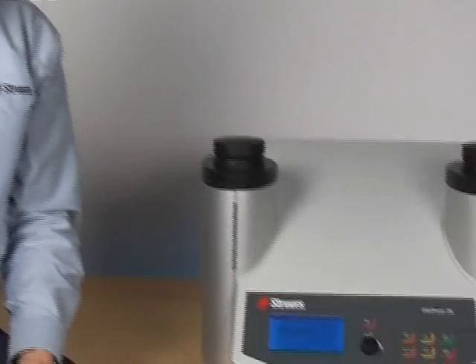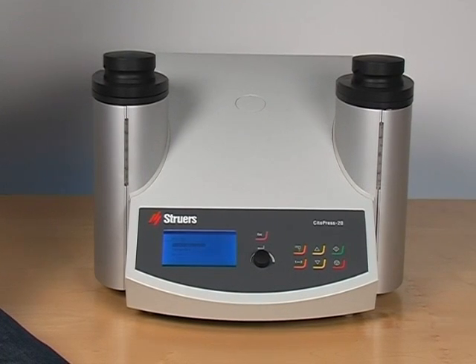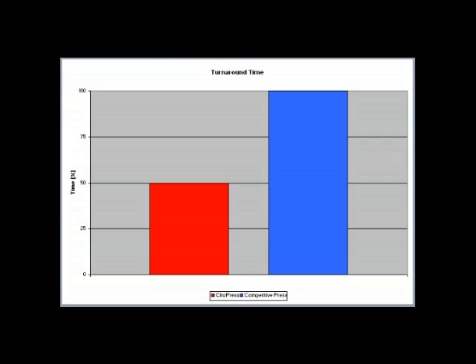We have taken a fresh look at what really matters for users of mounting presses. It's about getting mounts ready when they are needed — fast. With its low-mass mounting unit and powerful heating system, CitoPress sets new standards in turnaround time. In fact, when comparing CitoPress with its main competitor, CitoPress comes out 50% faster.